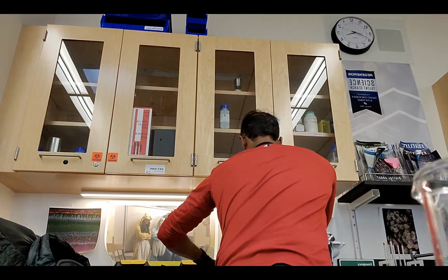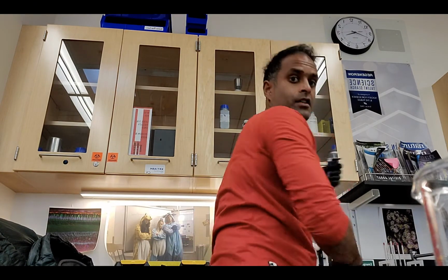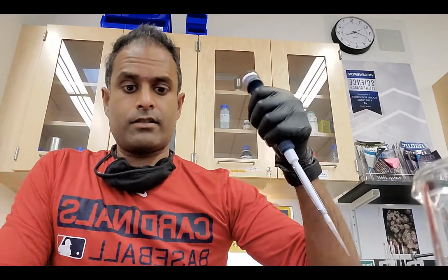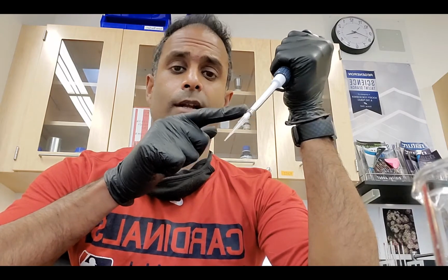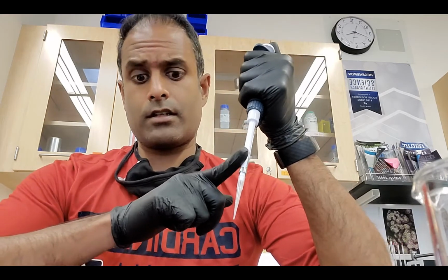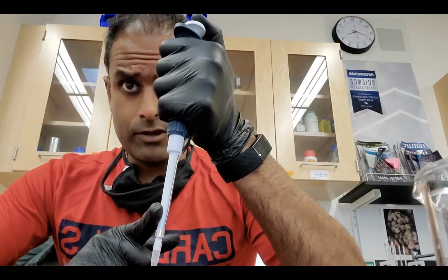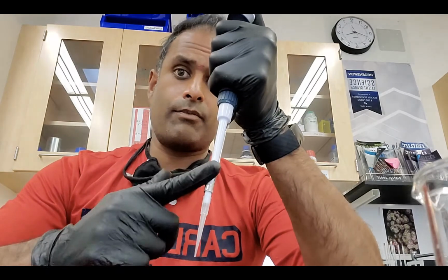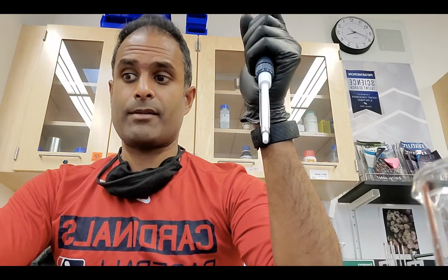Okay, so I'm going to go ahead and do my pipetting. All right, and to do my accurate pipetting, I'm going to hold my finger right about here on the pipette, and I'm going to count down 3 as I go in. Pull up, 1, 2, 3, and then put it into the tube, 1, 2, 3. Great, and then I'm going to use my dump beaker, and I'm going to put my tip in there.